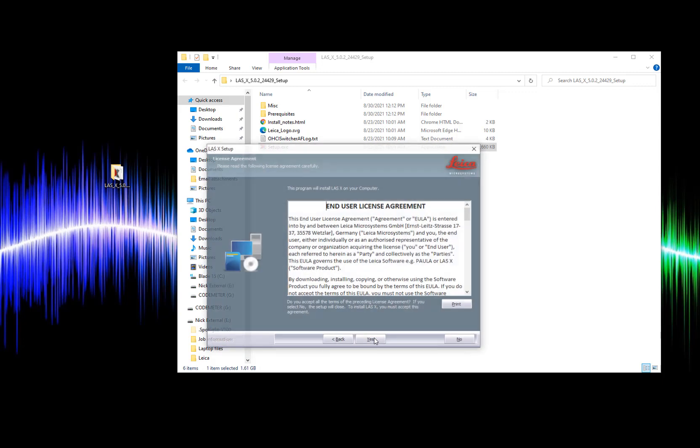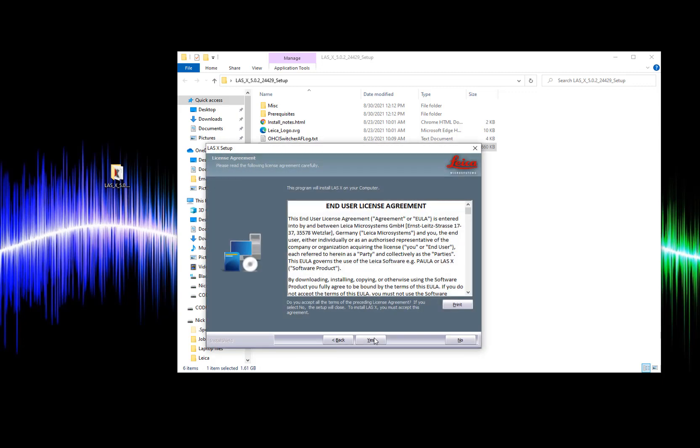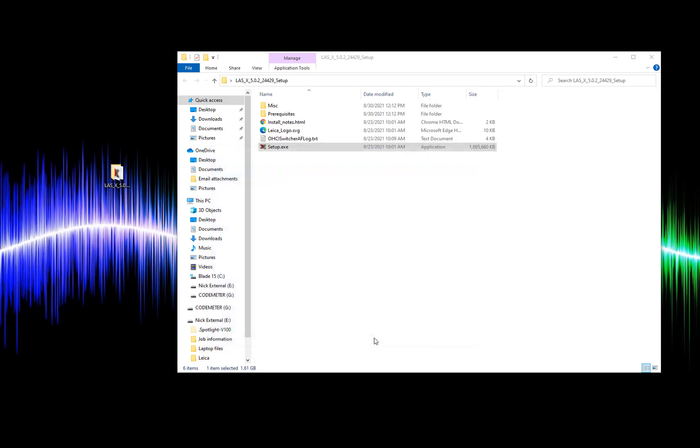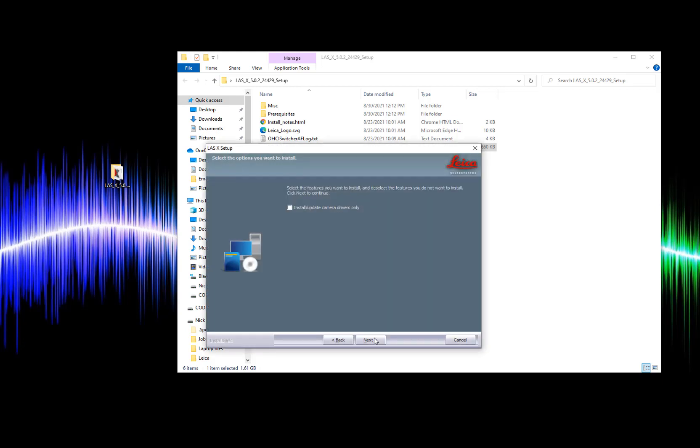Here we'll click next, accept the license agreement. Here we can check this box if we're only trying to update our camera drivers, but in this case we'll leave it unchecked to do the full installation.